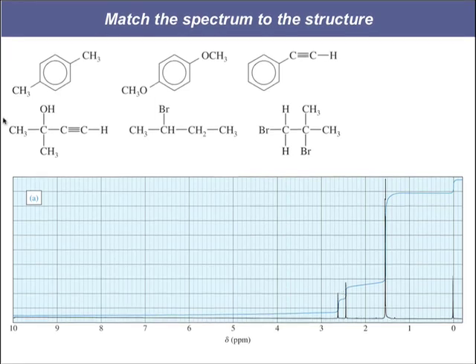Our other methyls, there's 6 of them. So these integrations should be 6 times what our other integrations are. So it should be about 6 mouse cursors. We can maybe go 1, 2, 3, 4, 5, 6, pretty close to 6. So that makes sense. Our big integration should be our methyls, the lowest, most upfield peak. Then we have a 2.5 integrating to 1. That's clearly our acetylene. And we've got something higher than that integrating to 1, which is clearly our alcohol.